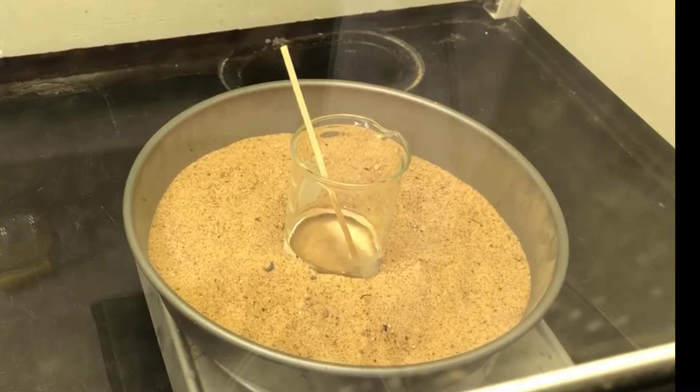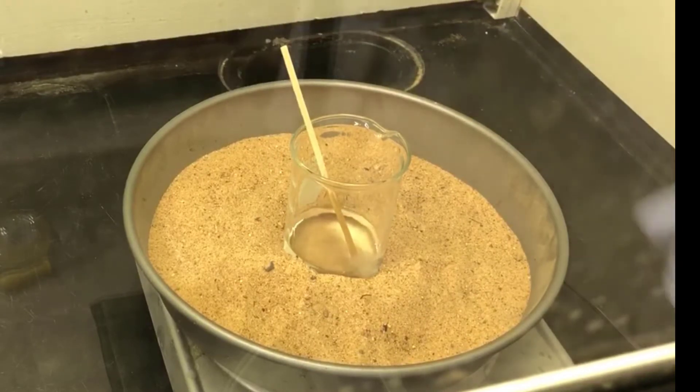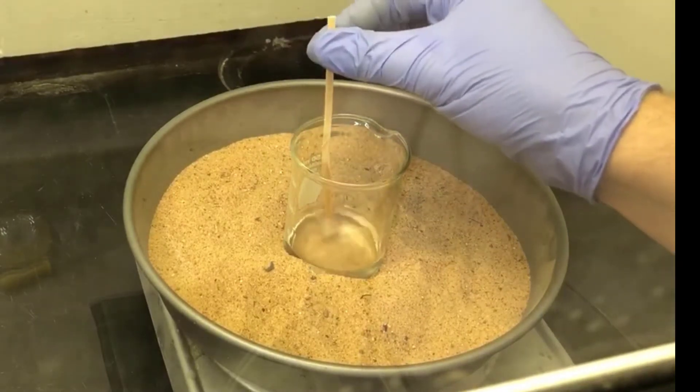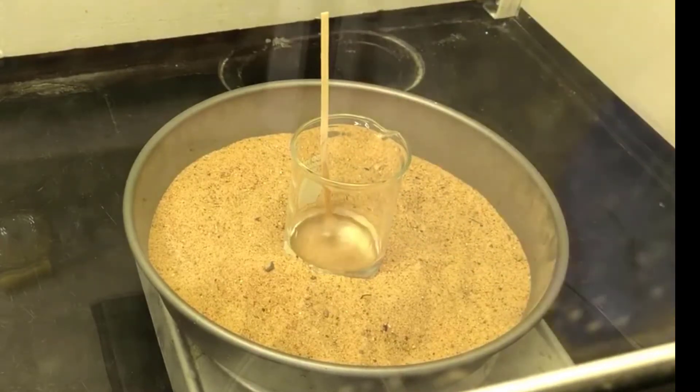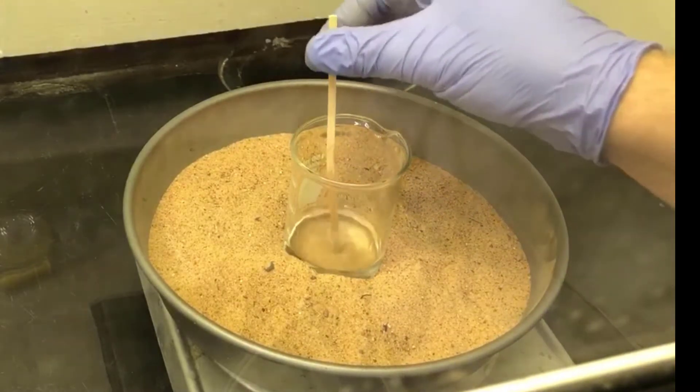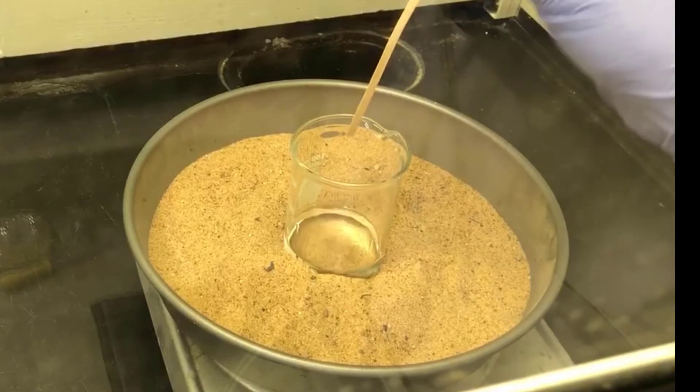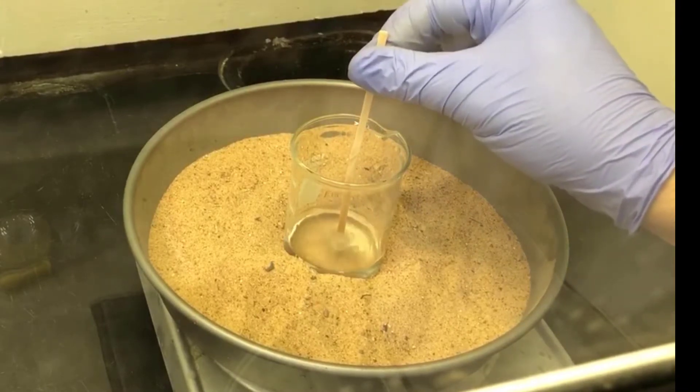The stick functions as a pore surface for bubbles to form on. It helps smooth out the boiling and keeps the solution from becoming superheated and bumping. It functions in the same way as a boiling chip, if you've ever used one of those. It's just a lot easier to remove a stick at the end. When I remove the stick, you can see the bubbling stops, and then when I put the stick back in, it resumes.